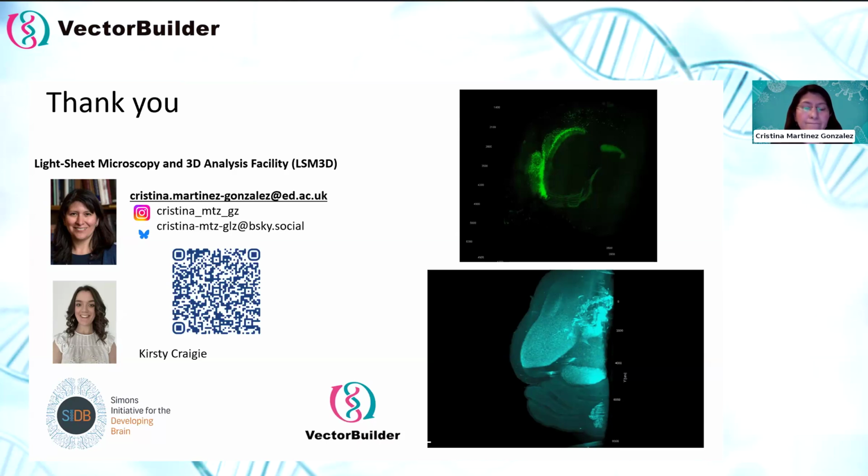Fantastic. Great, thank you. The next question is, do you think shelf-stable PFA solutions are comparable to freshly made powder-based ones? Sorry, so do you think shelf-stable PFA solutions are comparable to freshly made from powder-based?